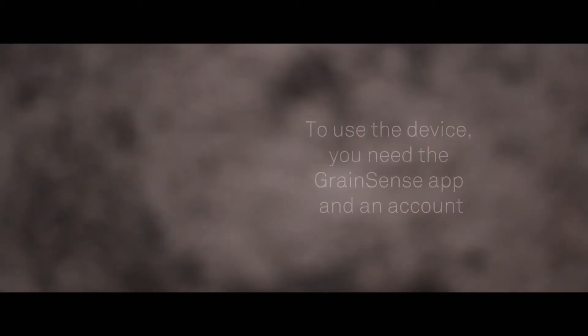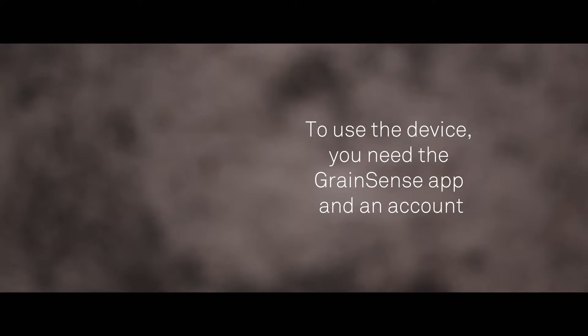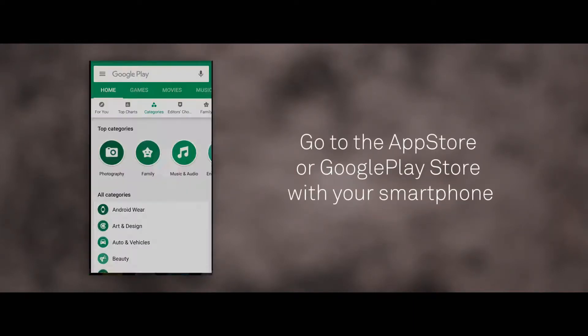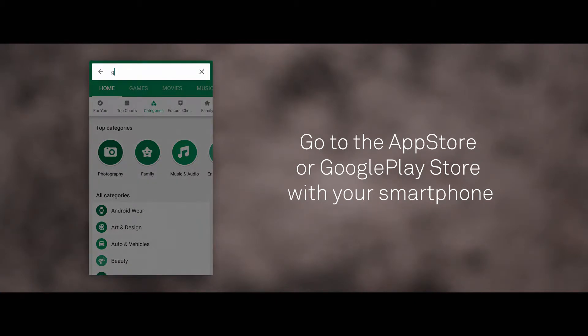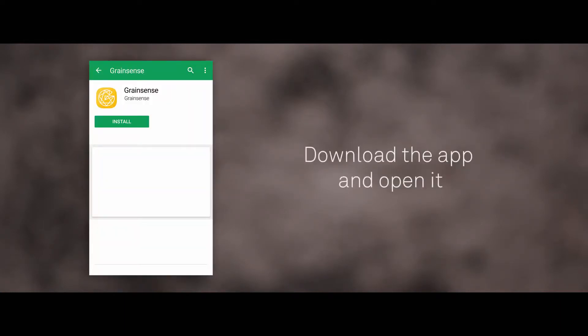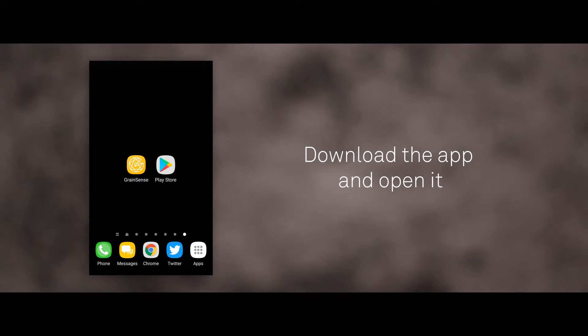Initial Setup. To use the device, you need the GrainSense app and an account. Go to the App Store or Google Play Store with your smartphone. Search for GrainSense. Download the app and open it.